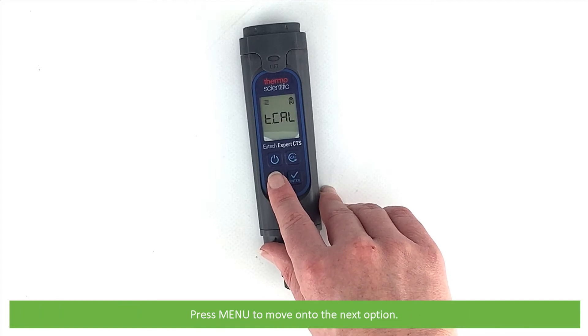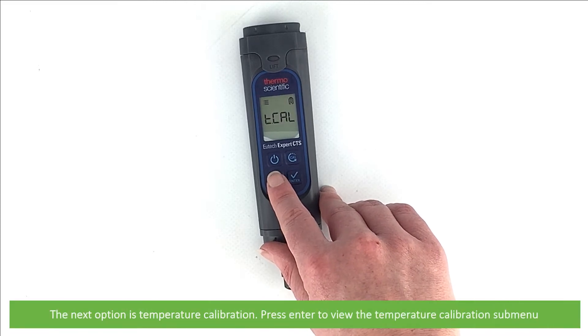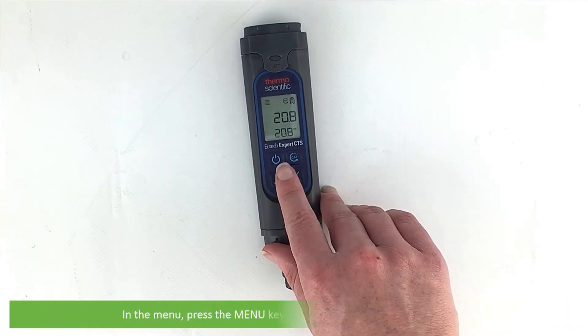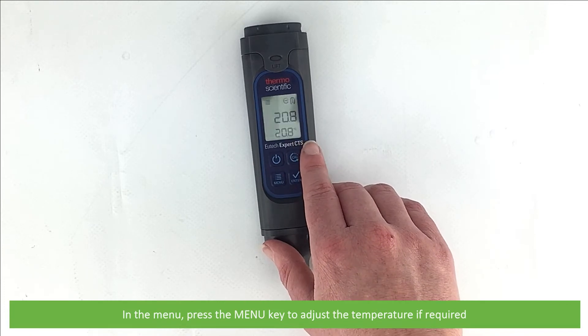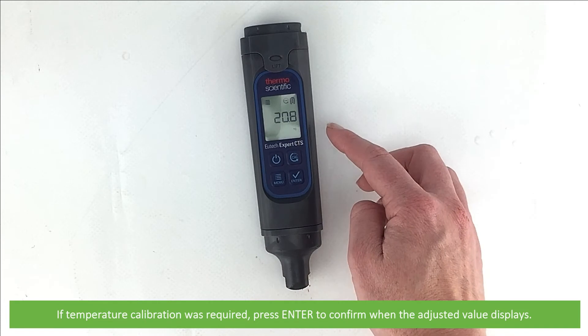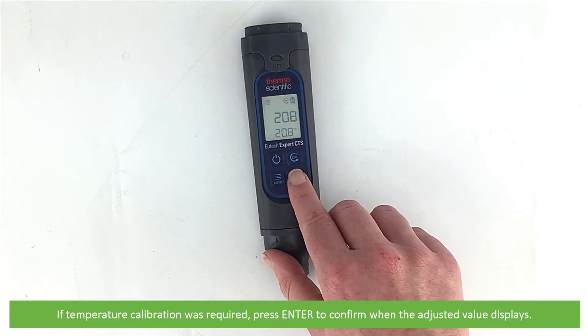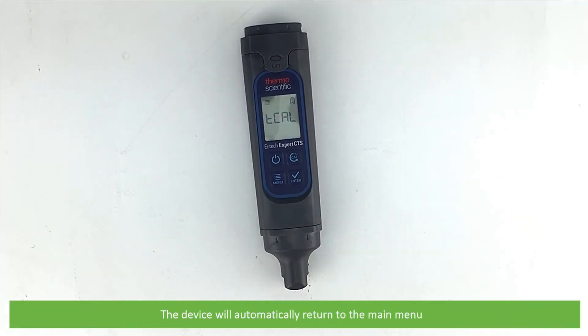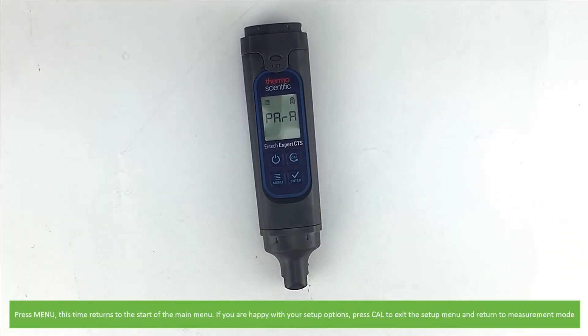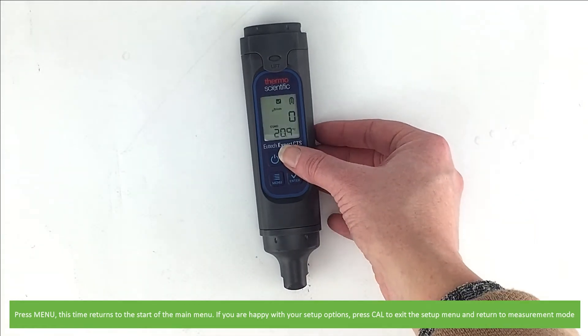Press Menu to move on to the next and final option: temperature calibration. Press Enter to view the temperature calibration submenu. Press the Menu key to adjust the temperature if required. If temperature calibration is required, press Enter to confirm when the adjusted value displays. The device will automatically return to the main menu. Pressing Menu this time returns to the start of the main menu. If you're happy with your setup options, press Cal to exit the setup menu and return to measurement mode.